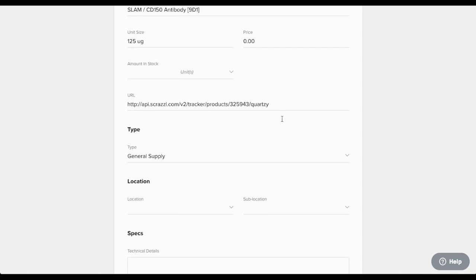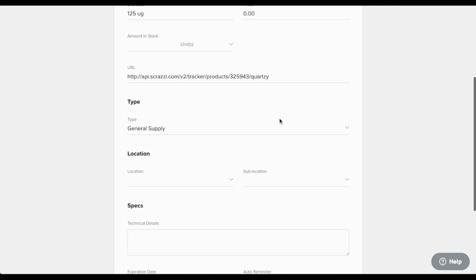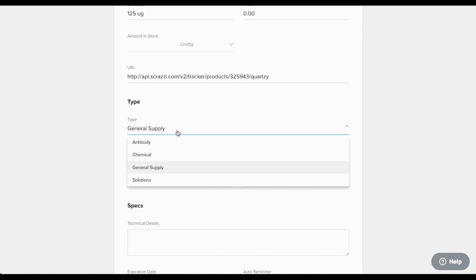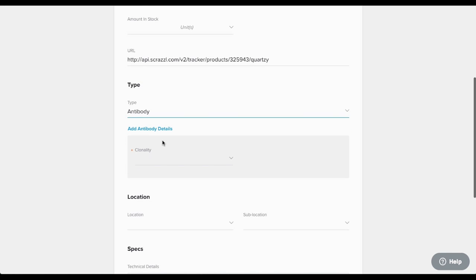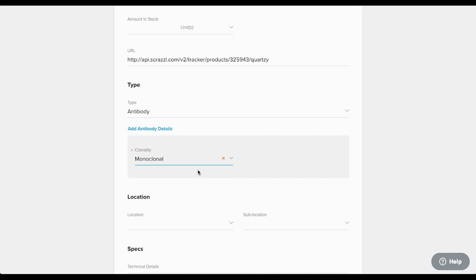Next, categorize your item. General supply will be selected by default, but you can choose any other type that's available in your group. Remember, this is why we recommend that you customize the types beforehand so you can select the most correct type from the list. Then add any details to the custom fields section.